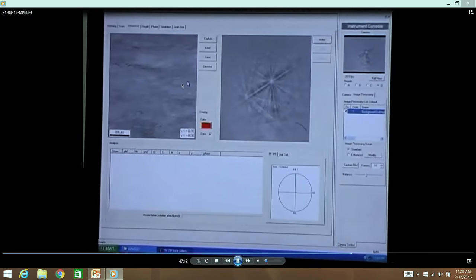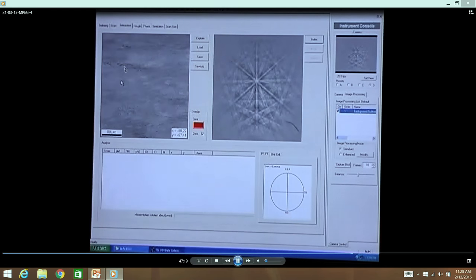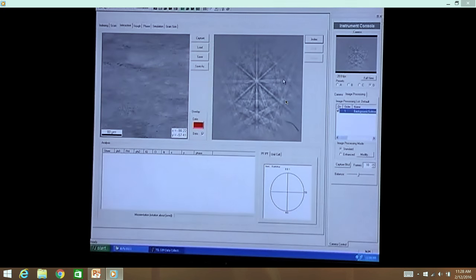So now what happens is the beam is directly connected to, synchronized with your mouse. So wherever you put the cursor on the sample and then click, the corresponding Kikuchi lines are generated here at each point, and this information is coming from the sample about 20 nanometer thickness.